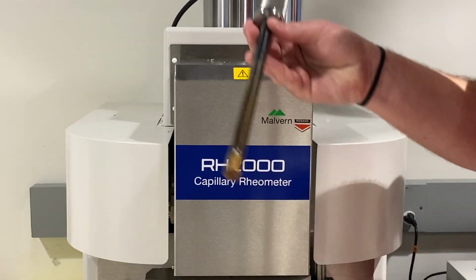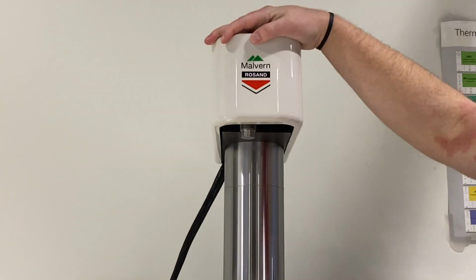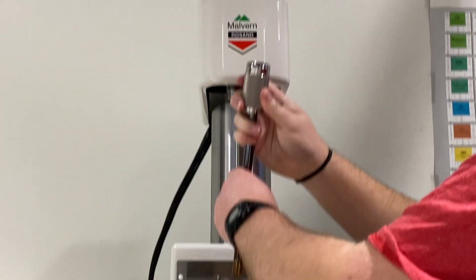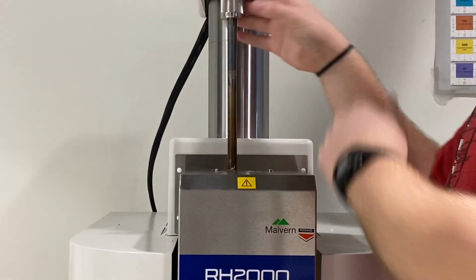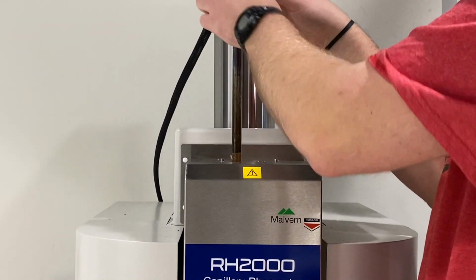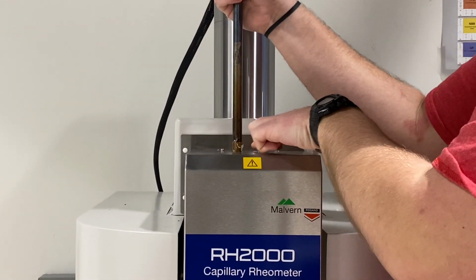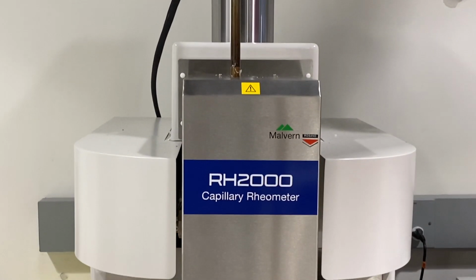Alright, so now we're going to install our piston. All we have to do is just rotate this over until it stops. Drop this in there a little bit. Screw it on. And like I said earlier, everything on this machine gets hand tightened. See, it's already picked up some material because it's heating up very quickly. So we're going to start the test soon.